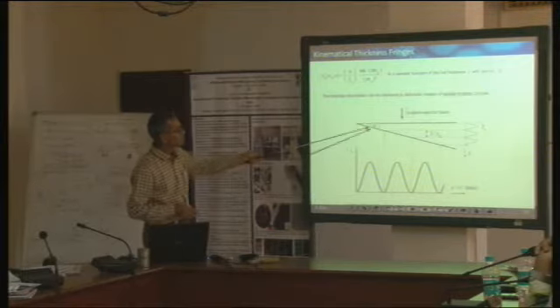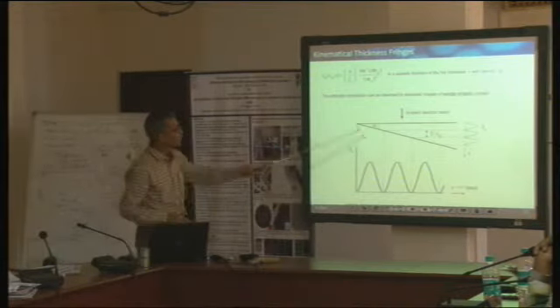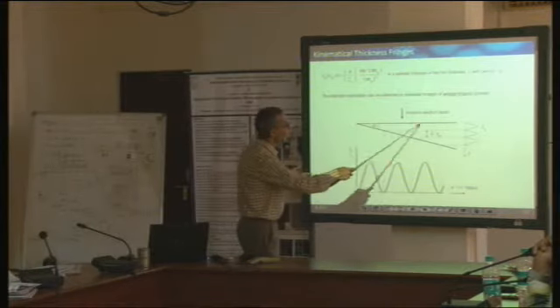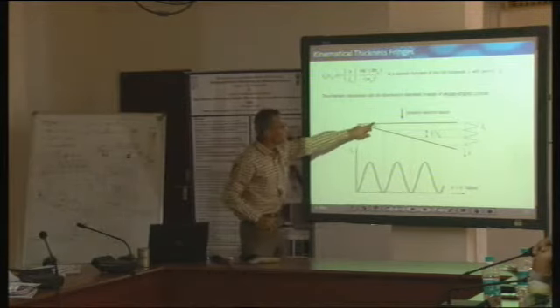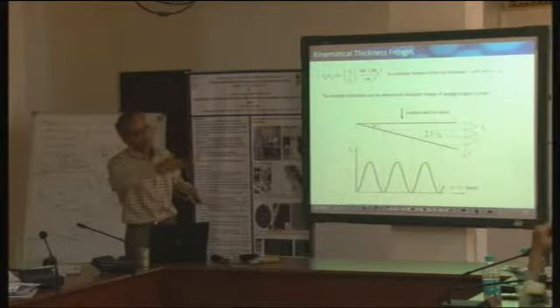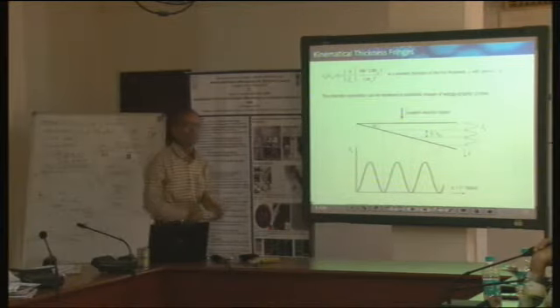I have spoken of the periodicity that depends also on T, and therefore we get thickness fringes. Here we have a wedge-shaped sample. When we look at the image, it appears as if here I have one fringe, here another, here another. But that has nothing to do with lateral variation. It has to do with the fact that the thickness is different at each place. In the image, as I go away from the hole, I get fringes, but the background is that the thickness changes as we go deeper inside the sample.